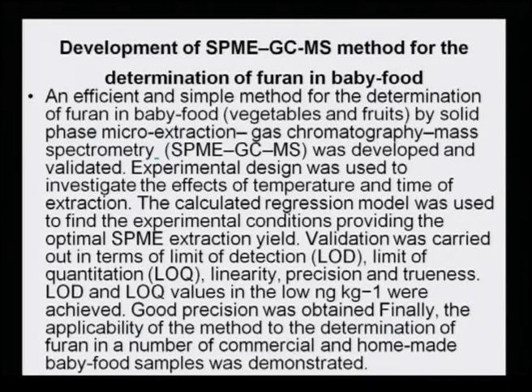It was developed primarily because the amount of furan in baby food is very small, in trace quantity. Experimental design was used to investigate the effects of temperature and time of extraction. The calculated regression model was used to find the experimental condition providing the optimal SPME extraction yield.